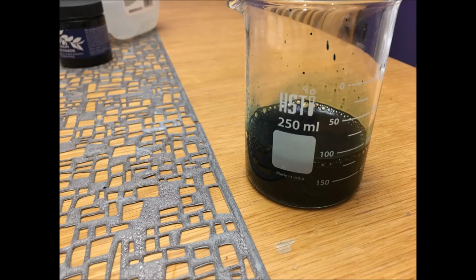Today I will be making Prussian Blue. Prussian Blue is an iron 2 ion surrounded by 6 cyanide ions. It isn't very toxic because the cyanides are very tightly joined together with the iron. It is commonly used as a dye in many paintings.